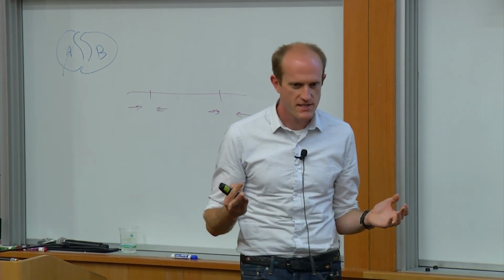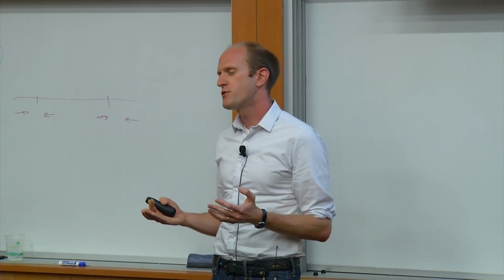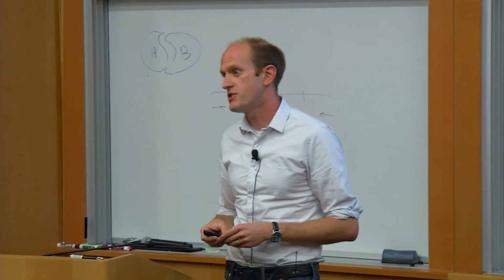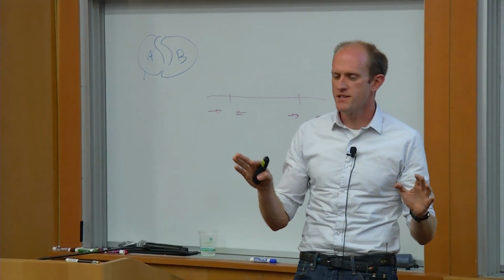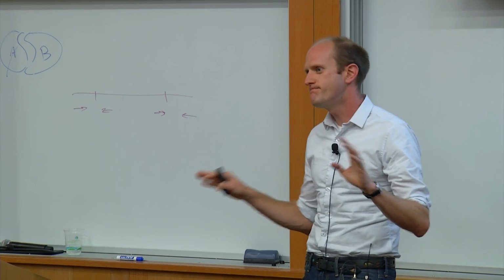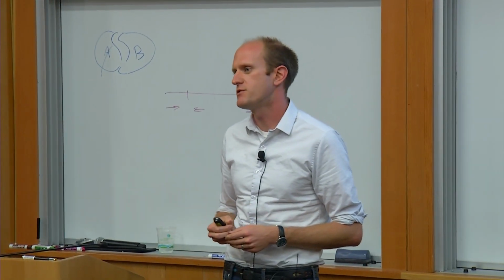In some ways, I think that's probably a little more honest, because really, at this stage in the game, we're not very far into bioinformatics for CRISPRs, or even just in bioinformatics for genome engineering in general. And so if someone were to point me at a server and say, I have one guide that scores 55 and another guide that scores 50, right? I'm not really necessarily going to choose the 55 versus 50. It's going to be very tough to know that there's a difference between them.